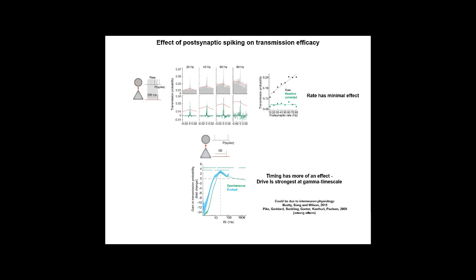But we really wanted to know whether this was a property of these two cells, so whether this effect would exist in isolation or if it was a network dynamic. So to do this, we used the silicon probes to control the activity and to make sure that we weren't tied to the network.